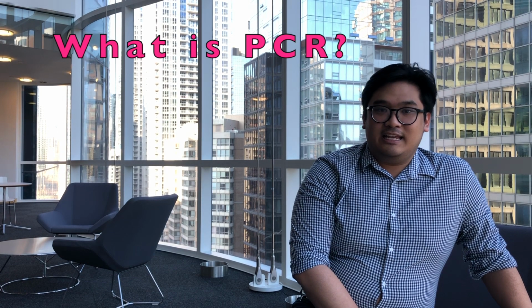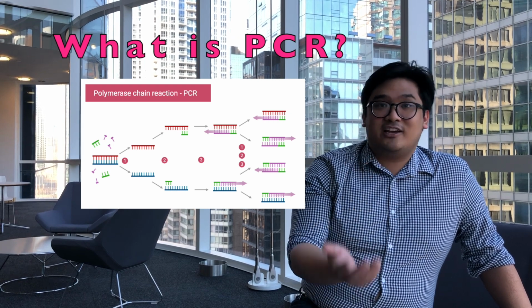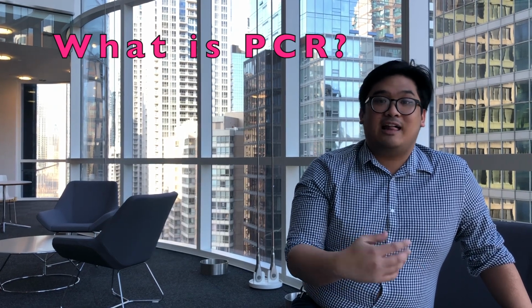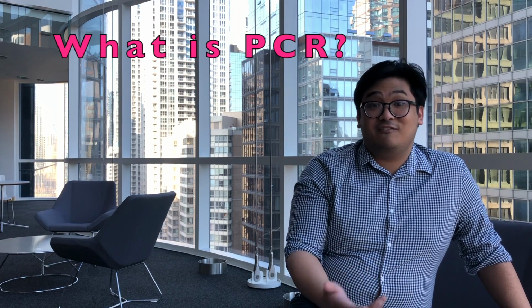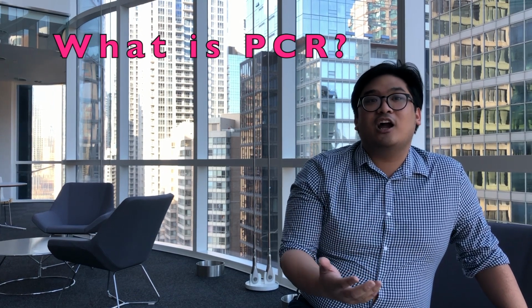Developed in the late 1980s, the polymerase chain reaction, or PCR, was first used to characterize the mutations associated with sickle cell anemia through the work of Randy Saiki and Kary Mullis. PCR is an important tool for molecular biologists today because it allows us to not only amplify but also detect short fragments of DNA in vitro.